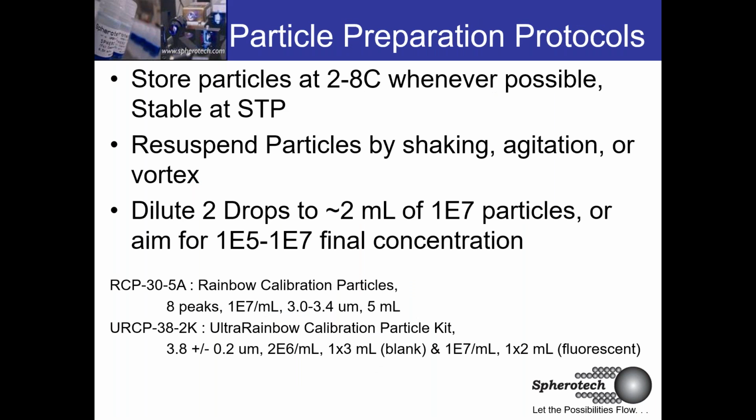So, particle preparation. Sometimes this is glossed over, but it's good to take a minute. I know it's very simple, but we store these particles typically at standard temperature and pressure, but preferably, whenever possible, refrigerated, just to reduce any potential microbials or just for the longevity of the particles. We don't typically want to freeze them. These particles, being mostly 3 micron, are going to settle over time inside of the bottle. So whenever you pick up the bottle, you want to give it a shake, agitate it, you might want to vortex it.